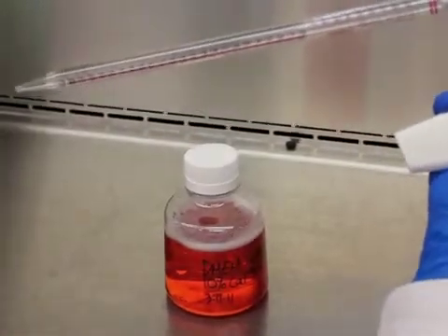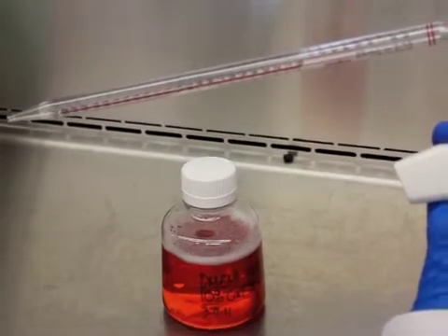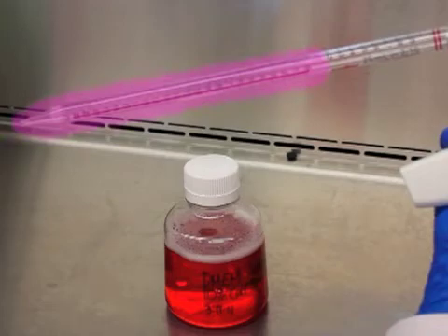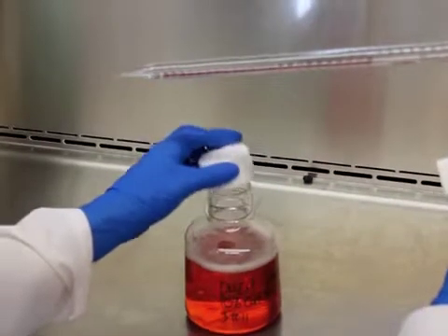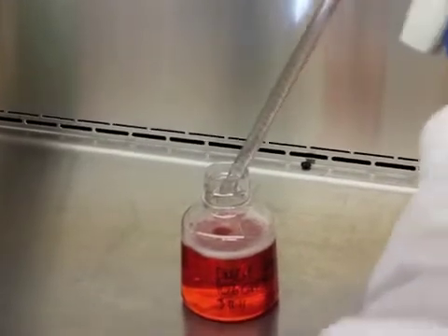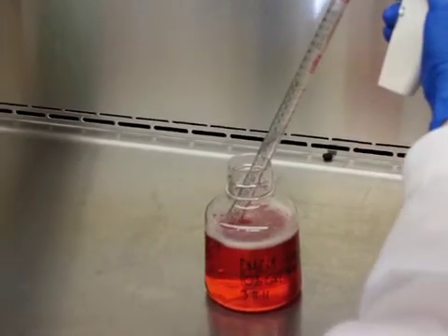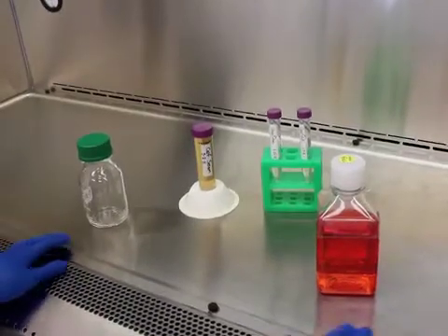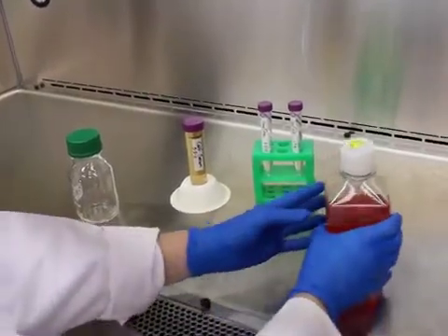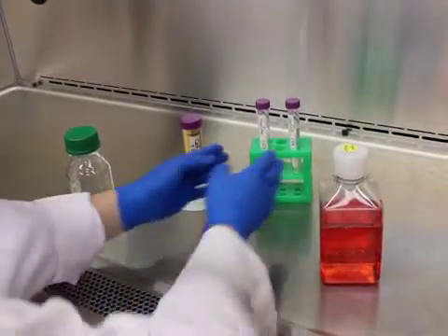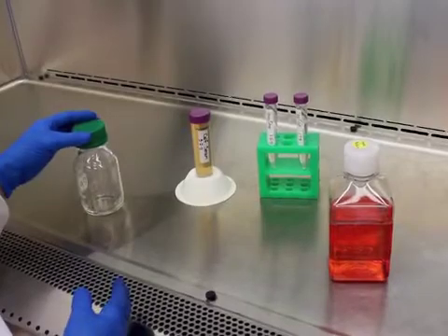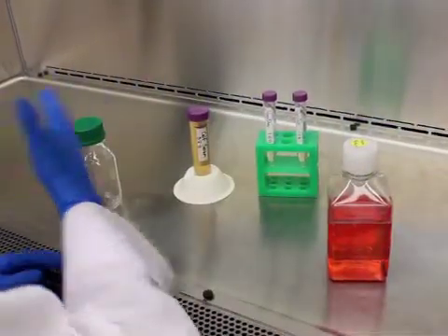Good sterile technique also requires that you become aware of each pipette you use and maintain the sterility of the tip and shaft of the pipette. Any contamination on the shaft or tip of a pipette could readily be transferred to a bottle of medium or flask of cells. In order to accomplish these goals and to keep all vessels and pipettes sterile, it's a good idea to organize the items in the hood workspace in such a fashion that you can reach each item without having to pass your hand above any other item.